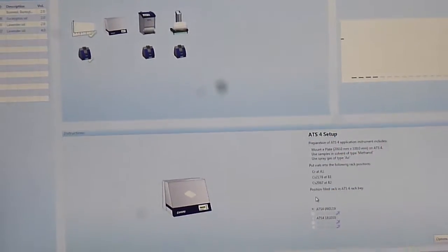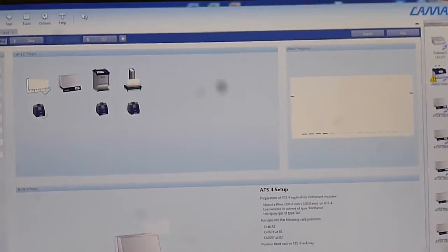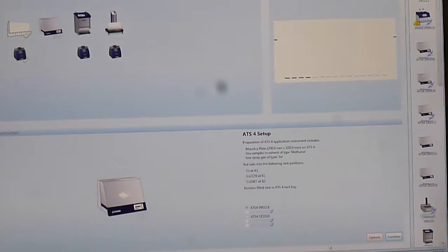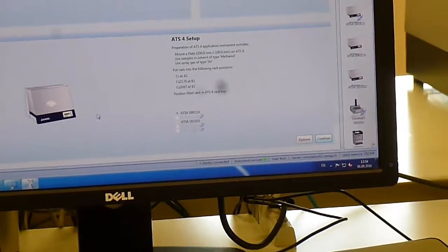And here it's the default parameter for our analysis, but then the user can change it if you want to do it. So, when I have the picture, I must click here accept, and so I can continue with the next step, and this will be the application.